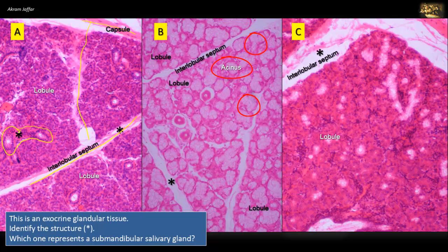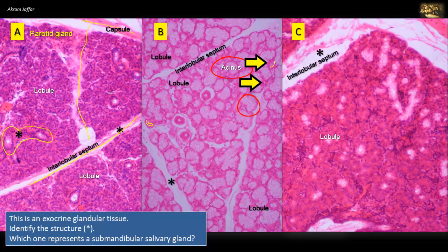Gland A is mainly serous. The serous cells stain red and the secretory granules are visible — this is the parotid gland, which is almost exclusively serous. The mucus-secreting cells in gland B are pale, because the mucus they contain is not stained. The mucous acini are in certain places surrounded by serous demilunes. Gland B is the sublingual gland, containing predominantly mucus-secreting acini, which are lightly stained in contrast to the serous acini of the parotid gland in A.